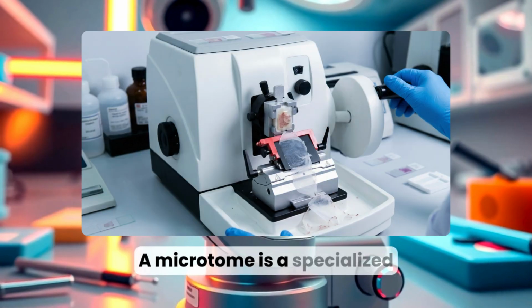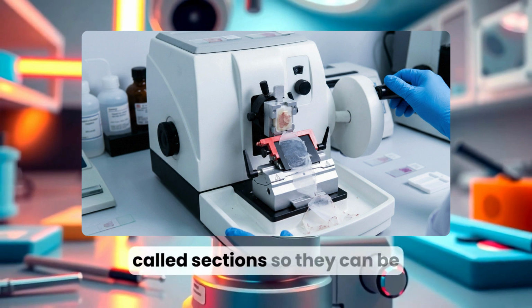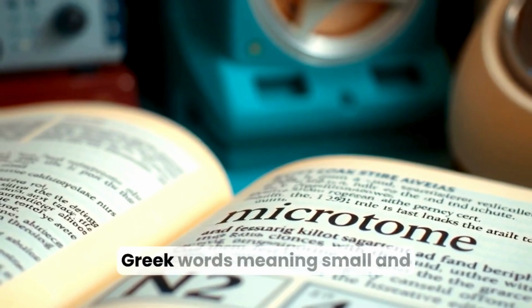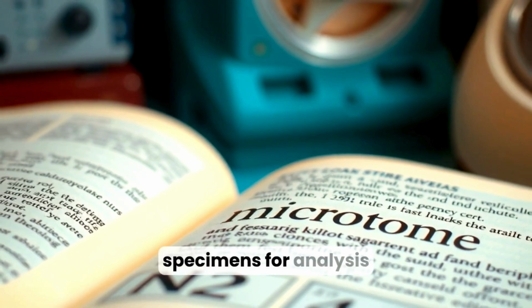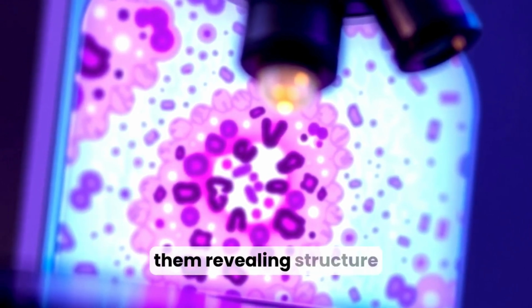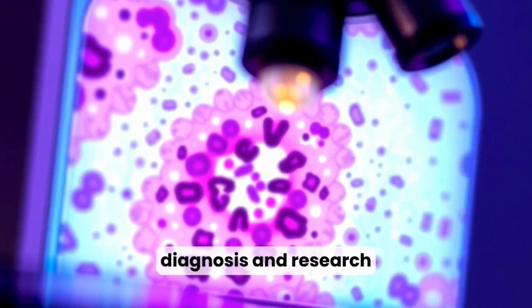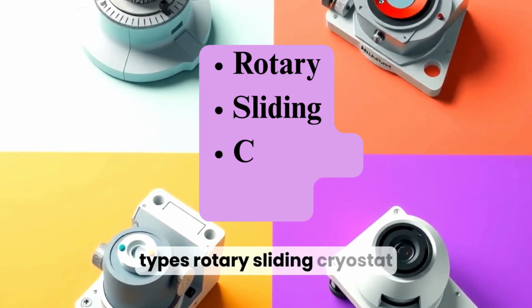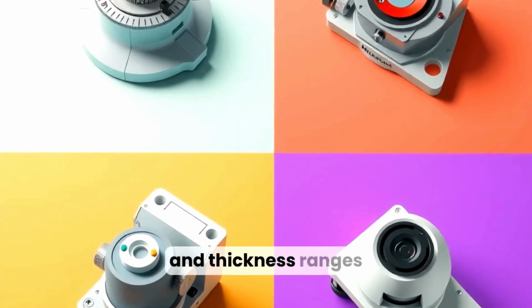A microtome is a specialized instrument designed to cut those extremely thin slices, called sections, so they can be examined under a microscope. The term microtome comes from Greek words meaning small and to cut, which reflects its precise function in preparing specimens for analysis. These sections are so thin that light transmits through them, revealing structure, pathology, and cellular relationships critical for diagnosis and research. Microtomes come in several types: rotary, sliding, cryostat, and ultramicrotomes, each suited to different materials and thickness ranges.